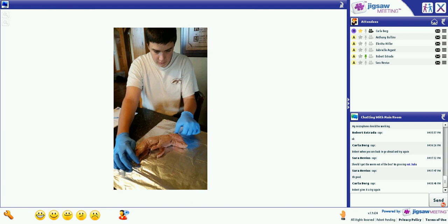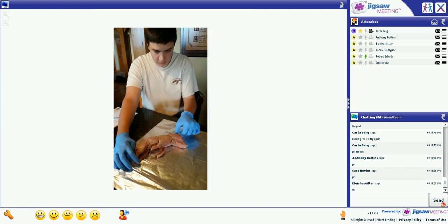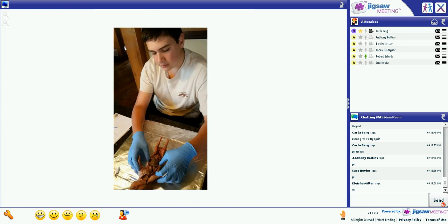Can you guys hear me? Okay. So first, I got the pig out, and my mom got some cardboard out, and we wrapped that in tin foil, and we put the pig on it. And my mom has a scalpel in her bathroom. So we started dissecting the pig, and we opened it up, and you could see all of its internal organs, and its heart, and its intestines, and lungs, and liver, and all that good stuff.